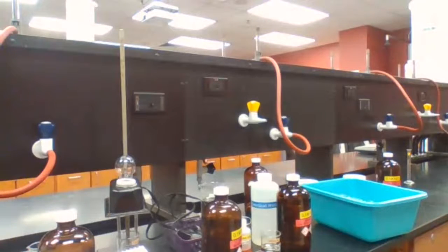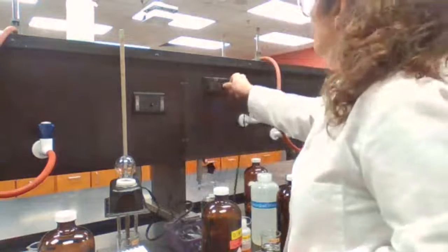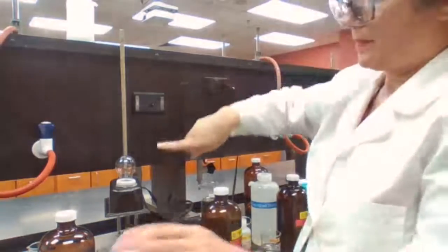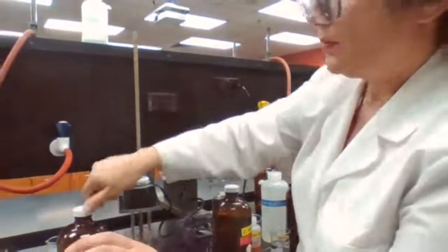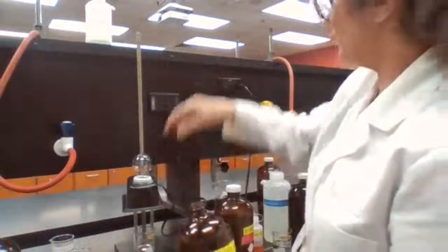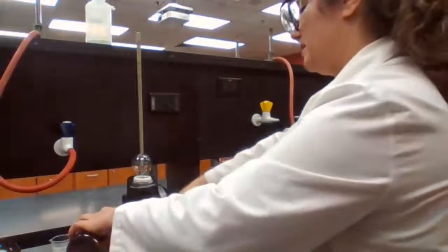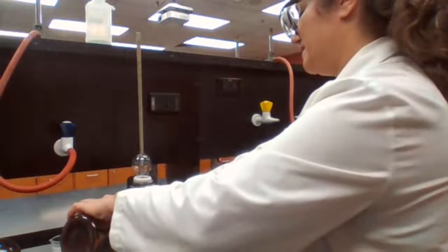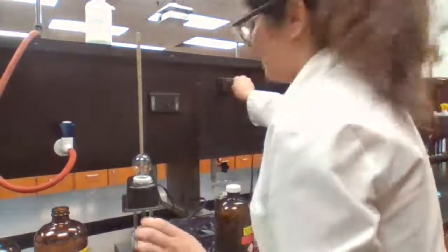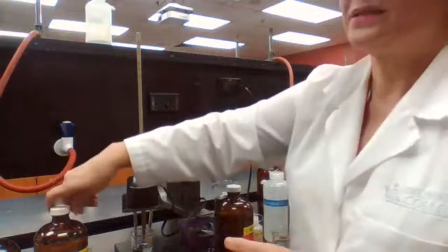Okay. Toluene itself is not an electrolyte. That was toluene. We add glacial acetic acid and we try to find out if it's going to be an electrolyte, if it's going to be able to dissociate the glacial acetic acid. So toluene plus acetic acid.